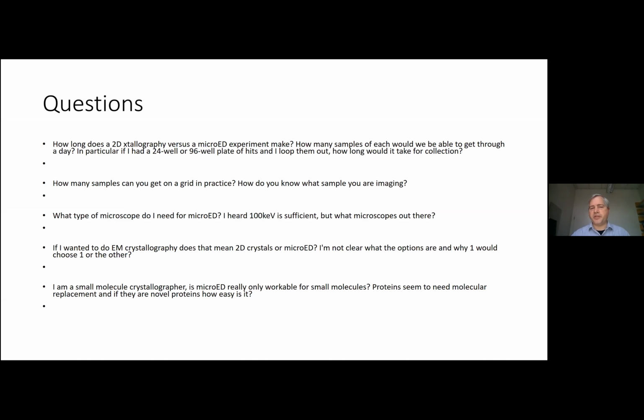2D crystallography is a long time. MicroED is less. You can screen through it. Screening through a grid for crystals would be like screening for a single particle. You're looking for whether you have crystals or not. So it could take a long time or not, depending on how sparse or rare the crystals are. And once you find a crystal, you can very quickly take a diffraction image of that crystal and see if it has a diffraction pattern and if that diffraction pattern goes to high resolution. So that could be reasonably fast to screen through.